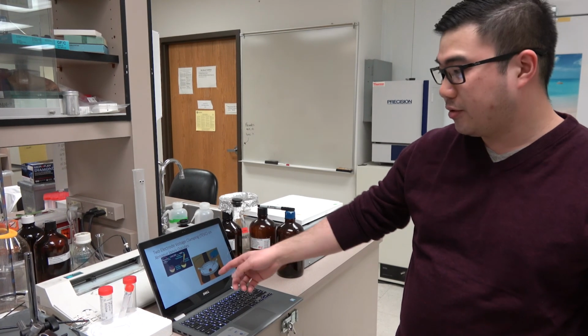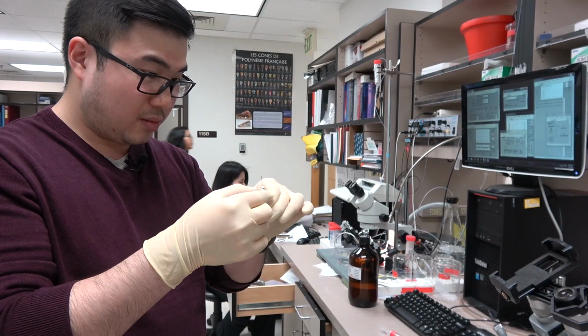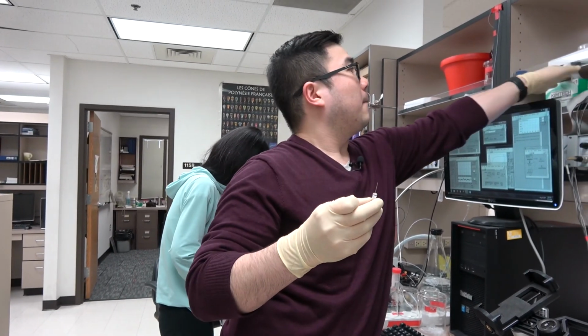Based on previous work by his colleagues, Peter knows that the natural peptide works. Peter is working to modify the molecule in the hopes of altering its properties. A version that lasts longer, for instance, wouldn't have to be injected as often. The beauty of being able to synthesize these molecules in the lab is, since they're short peptides, it becomes very manageable to swap out these amino acids for different ones or even insert non-natural variations. So we can potentially improve upon what we find in the venoms. We can tailor it to better suit our needs as humans in need of therapeutics.